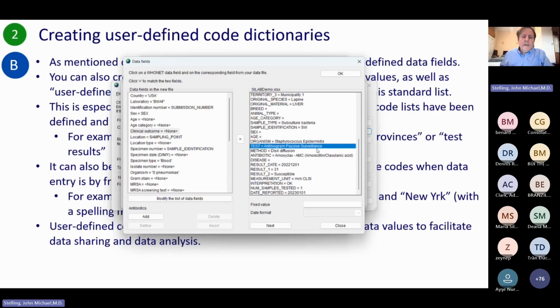Passive surveillance usually refers, not always, to the diseased animals because this is normal daily operations. Whereas active surveillance is often like a project or something monthly or something required by regulation. So I'm going to say that clinical outcome is equal to that.